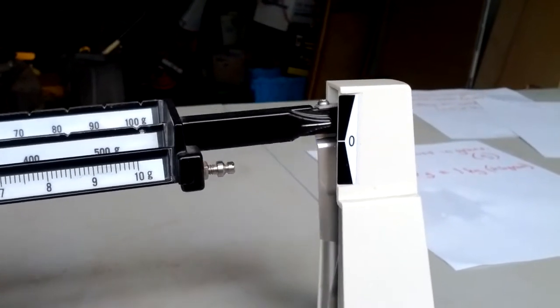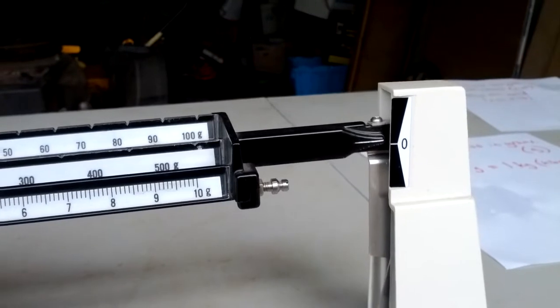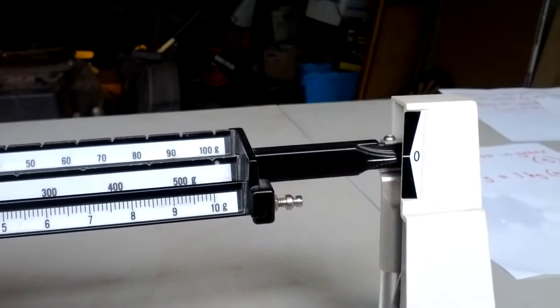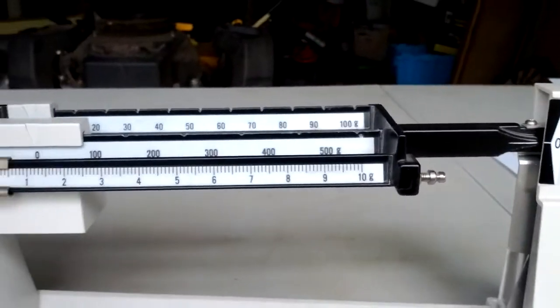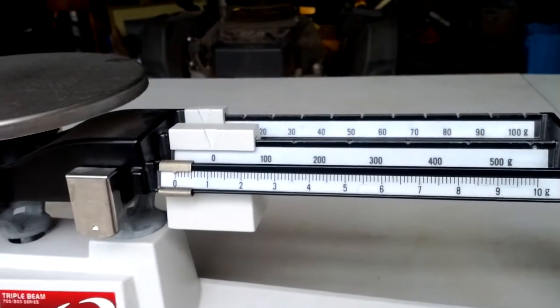And you see if you touch it, it kind of swings back and forth. But once it finishes swinging, it should be right at zero. We don't push on it hard. We don't slam it. We just set things on there easily. That's a triple beam.